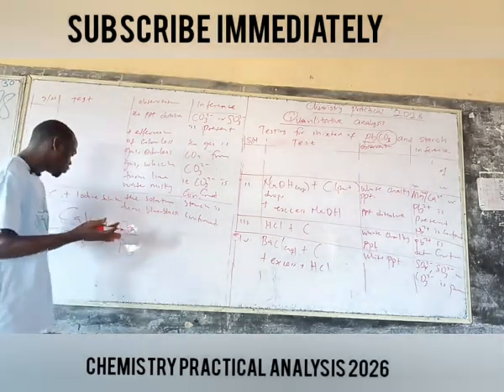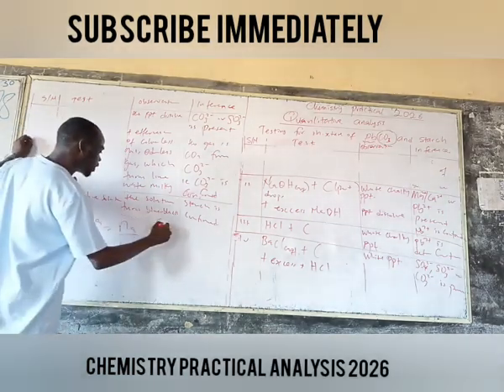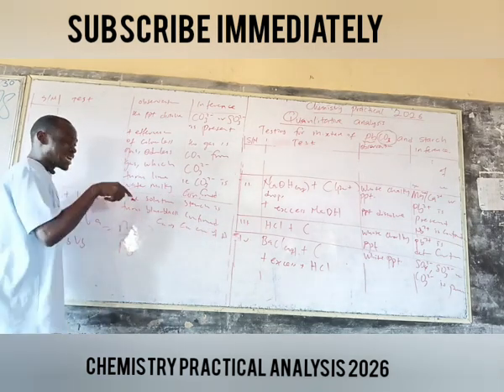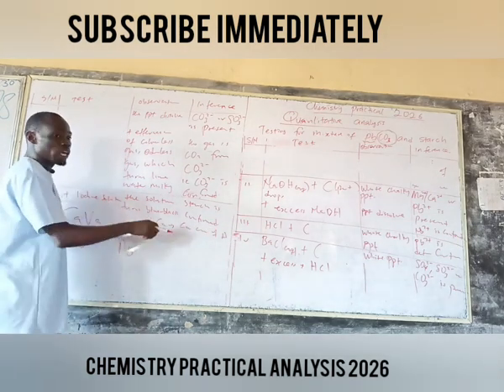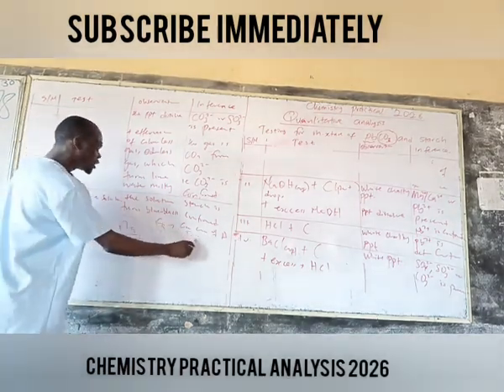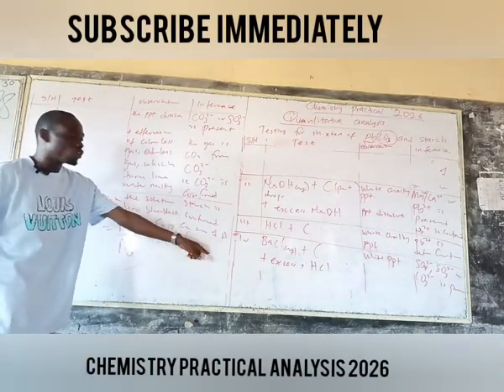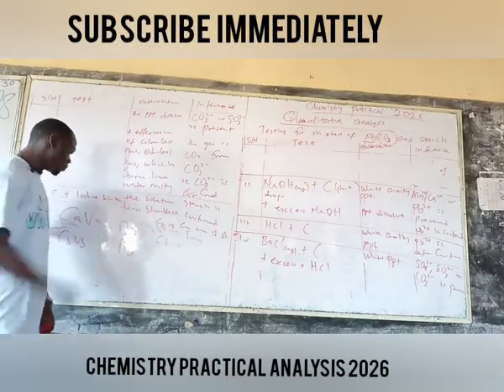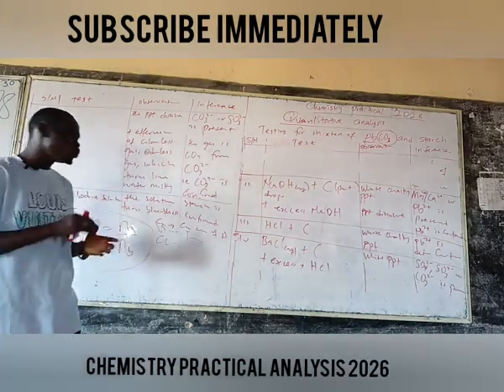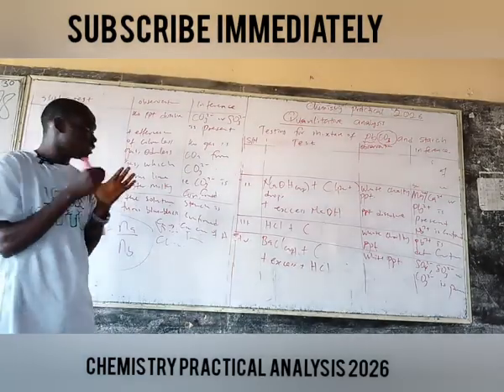You have a lot of space in your book. So what you have to do is say CA is equal to what? Concentration of A. If you are given in your question that A is H2SO4, don't just say acid. Concentration of H2SO4, if it is stated, VA, volume of the acid used, CB, concentration of B. Then make sure you state the unit in mole per dm cube, or cm cube, number of moles of acid, number of moles of base, before you use it in the formula. Please take note of those facts and take note of the units.